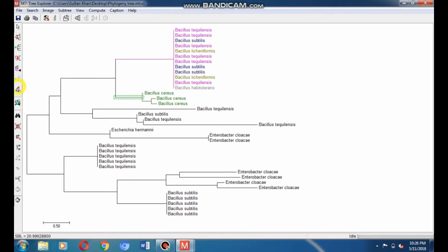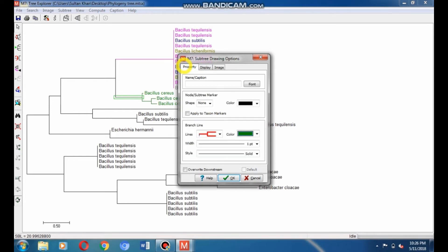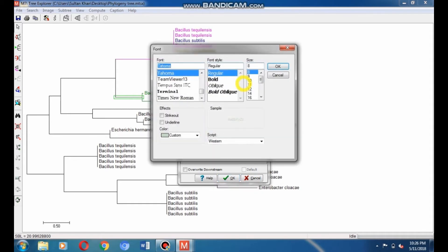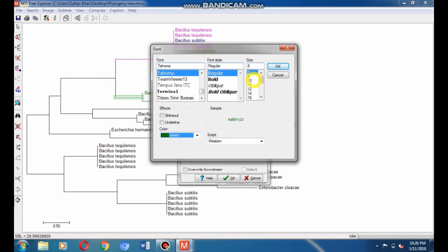Select Display Caption and Bracket to allow them to display. Select the bracket style — either square or line style. Go to Caption and type a caption such as 'cereus'. You can give a color to the caption. I give it green color — go to Font, select the font color, give green color to the caption, and change the font size of the caption. Click OK to apply all the changes. Here you can see the green color cereus clade.